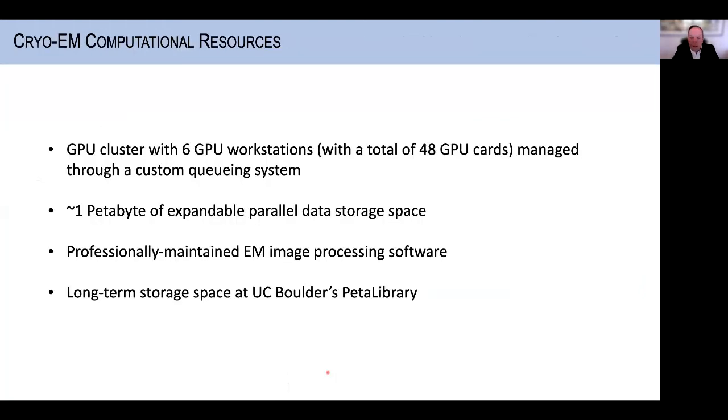So in order to make all of this happen, the facility counts with a vast amount of computational resources, also funded by the School of Medicine. We have a professionally managed GPU cluster with a large number of GPU cards distributed in 6 GPU workstations that are managed through a queuing system that allows users of the facility to analyze their data.